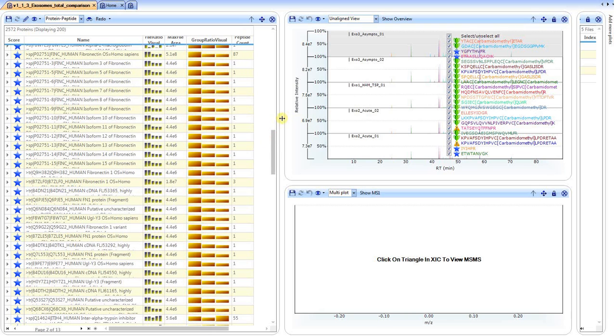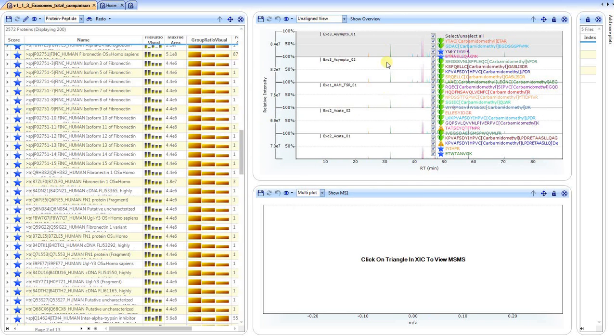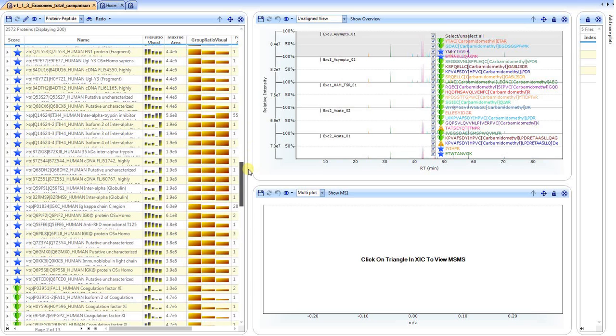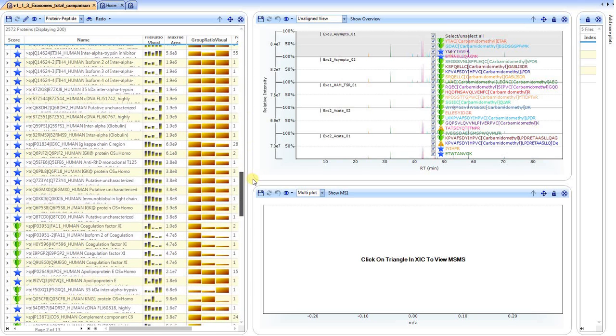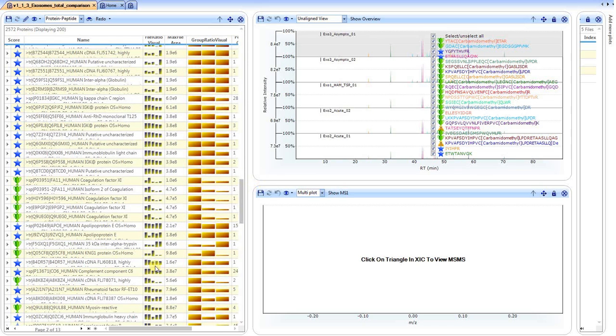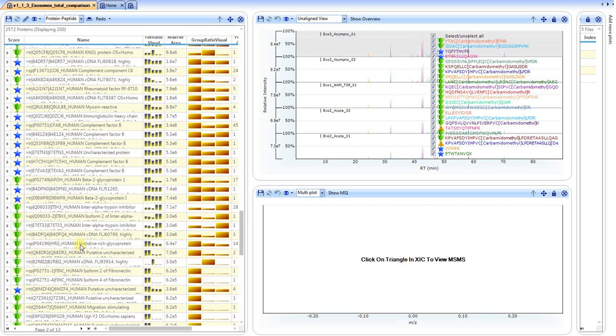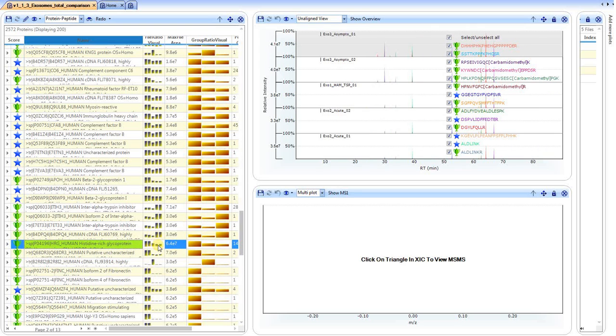The additional views that you would have are shown here in the chromatographic view. And again, as we're scrolling through this, we see the different responses of our particular proteins. And we can simply grab some that look kind of interesting. And again, this one shows that the response levels are sort of decreasing across the files. When we click on it, again, we've got 14 peptides that are associated with this particular protein.